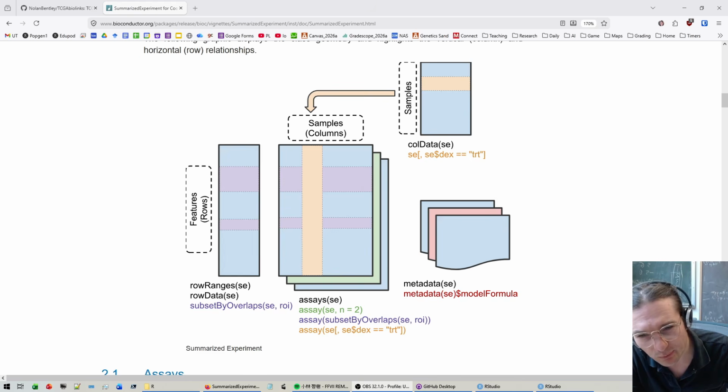If these were each of the different cases, here I have a data frame describing each of those cases as rows, but the columns are different descriptors, things like what tissue it is from, who is the hospital that submitted the sample, and things like that. Again, if I want to use that data, I typically use as.data.frame after the colData function.